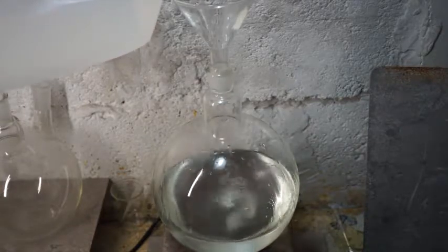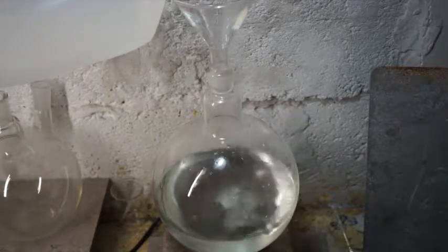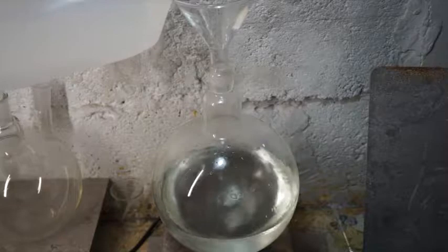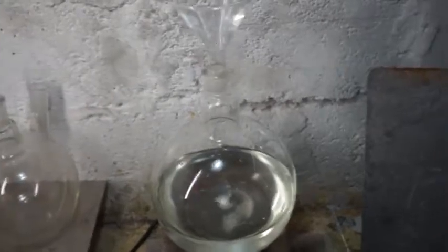What I have here is about 520 grams of pure silver dissolved in nitric acid. There is about 1200 milliliters of solution here with no free nitric acid remaining.